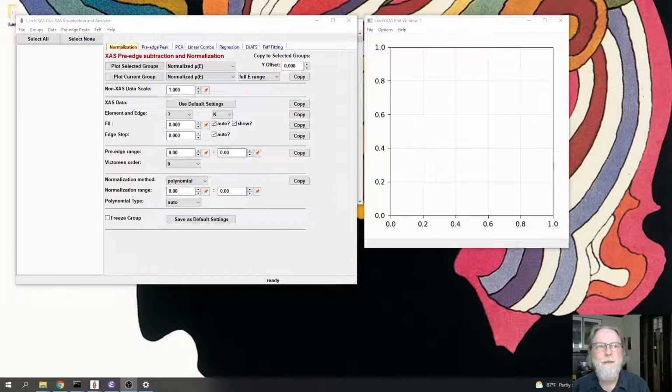Hi, I'm Matt Newville, and this is part of the video series for using Larch for XAFS analysis. In this video, I'll show you how you can use XAS Viewer to set up and run Feff calculations for extended XAFS. I should be clear that while the Feff codes can be used to calculate XANES and other X-ray core level spectroscopies, the versions of Feff that we have included with Larch are only able to do extended XAFS calculations.